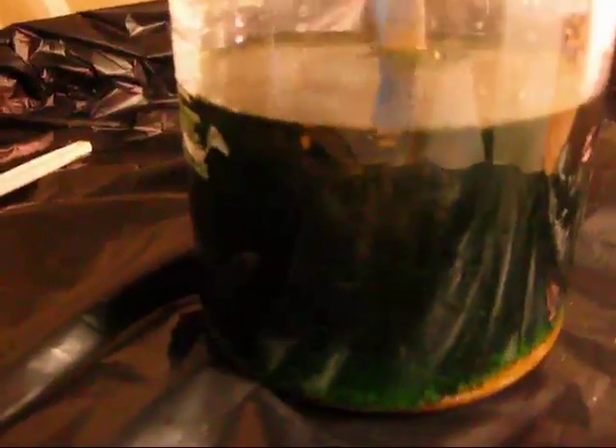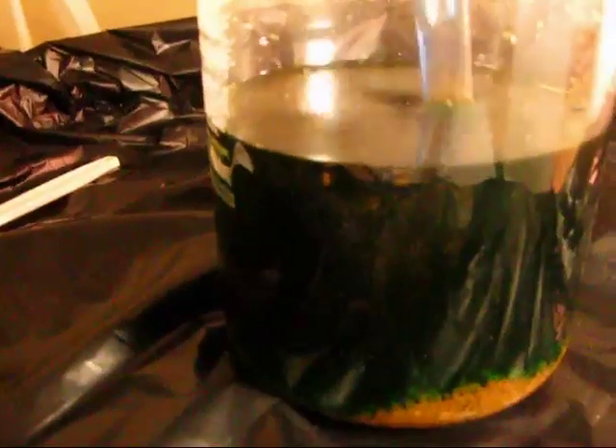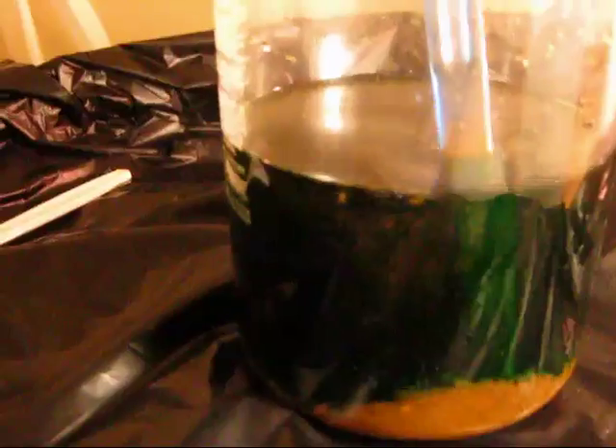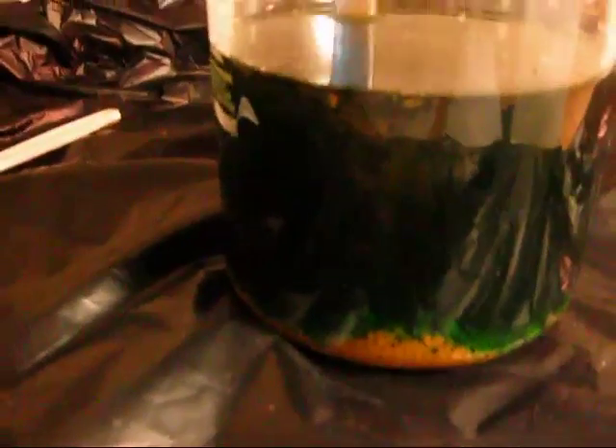After I rinse all this — and of course the chemical was neutralized so it's not doing any more chemical reaction — you've got to be careful with this stuff when it is reacting because it's very, very volatile and it will make you breathe uneasy. So always do this outside, and use rubber gloves, unlike the plastic gloves I'm using.